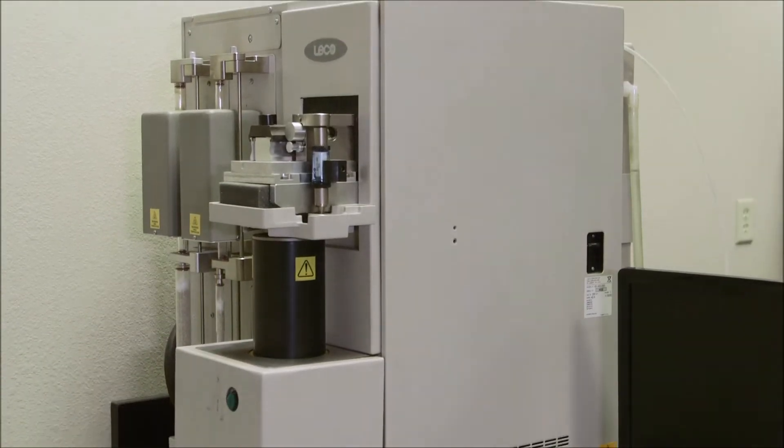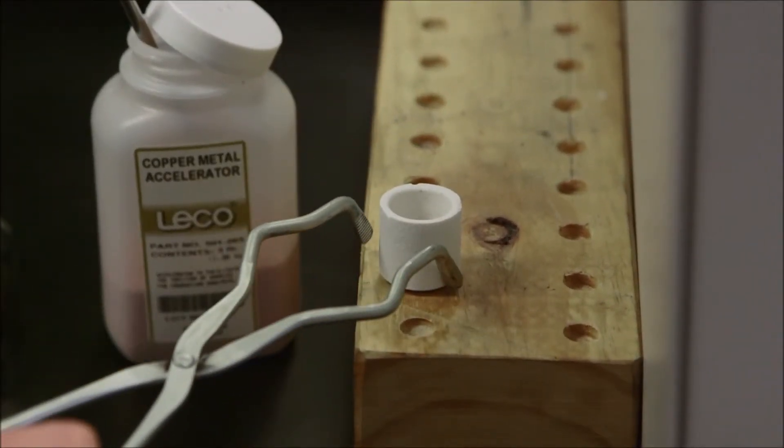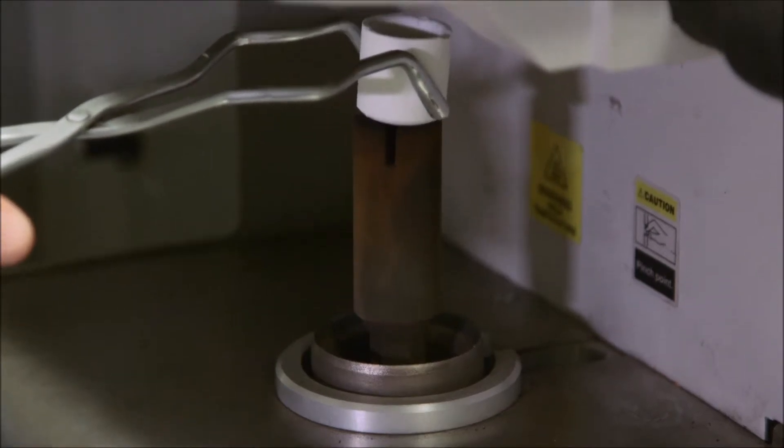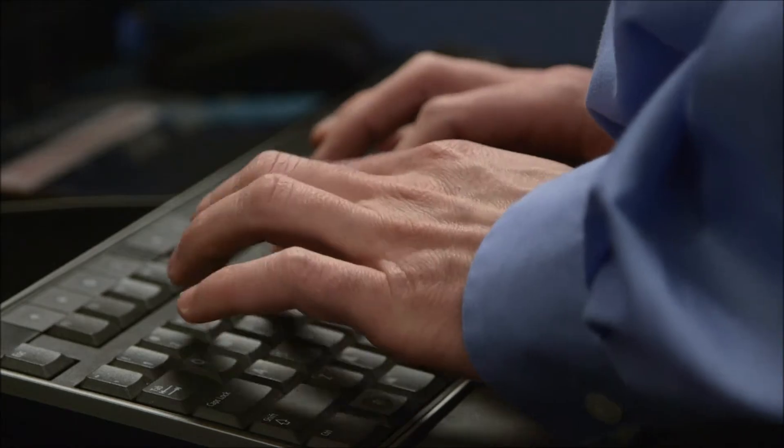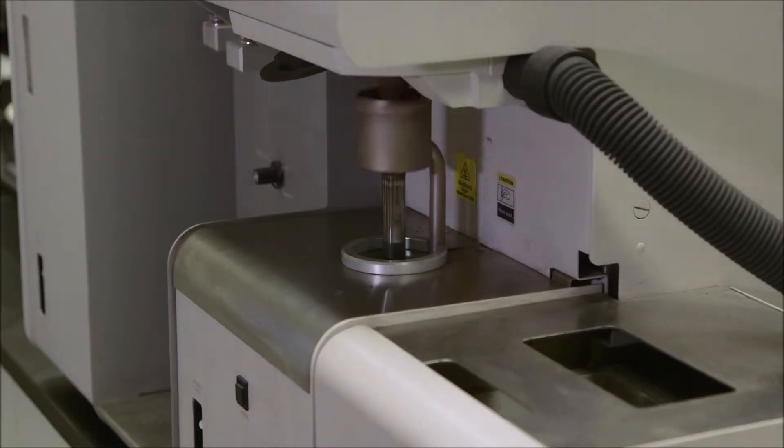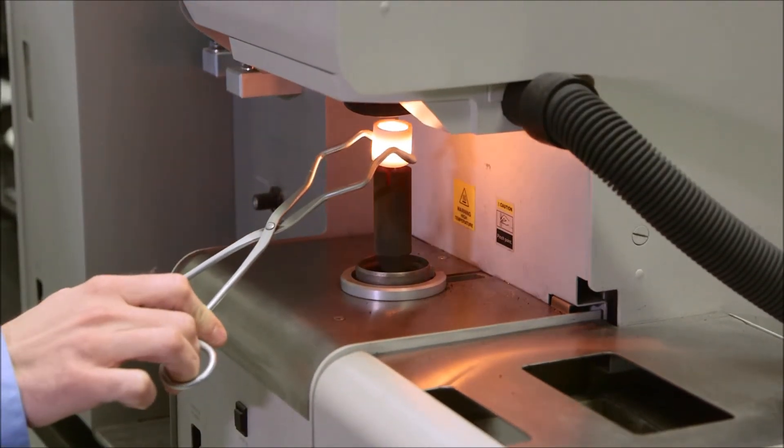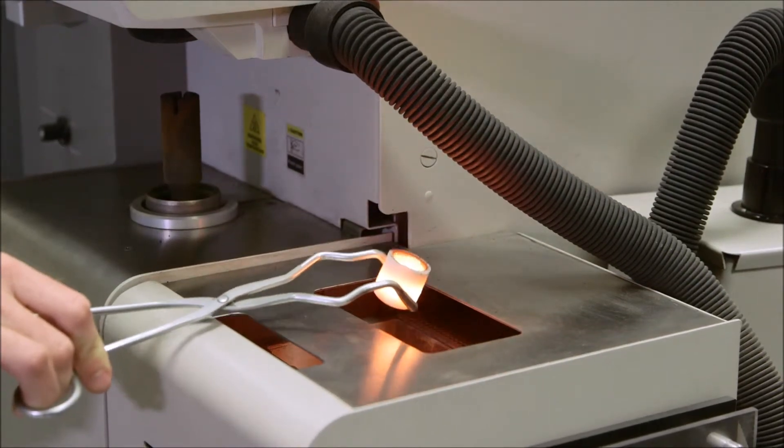While our spectrometer is a great method for identifying the chemical composition of our different materials that we use, we also have a LECO nitrogen analyzer and a LECO carbon detector for analyzing these very important small elements that exist within our materials. Our spectrometer doesn't have the capability of getting down to the precision on these certain elements. So these two tools are used for identifying with very high precision what the amount of carbon is within a material or what our nitrogen is within our material. There are cases where nitrogen contamination can lead to a dramatic failure in the field if our steels contain this high level of nitrogen.